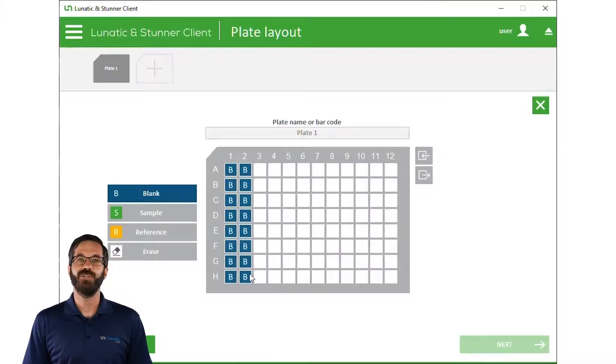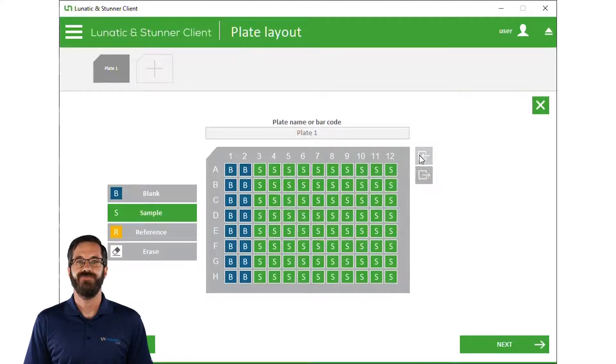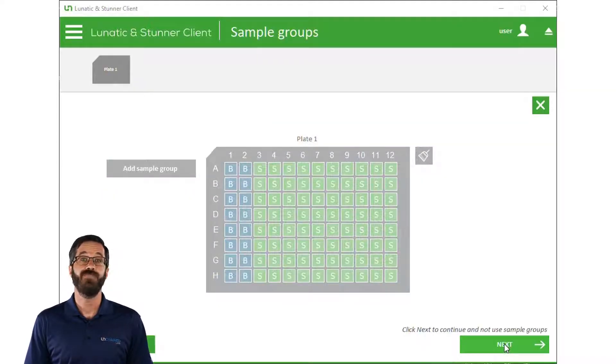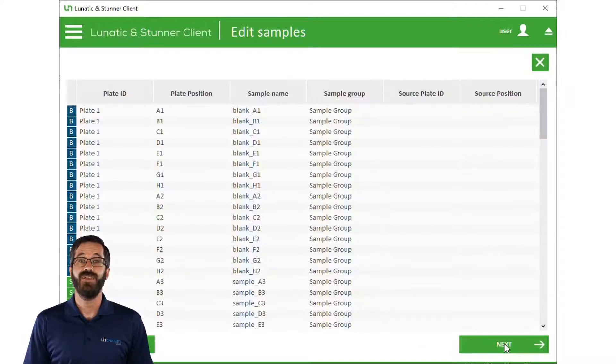Next, we tell the software which wells have sample and which have blank. We can populate a new plate manually or we can simply import and pull in all the information from an Excel file. Then we can apply sample groups. And if we want, we can change sample names as well as review to make sure all the samples are correct.